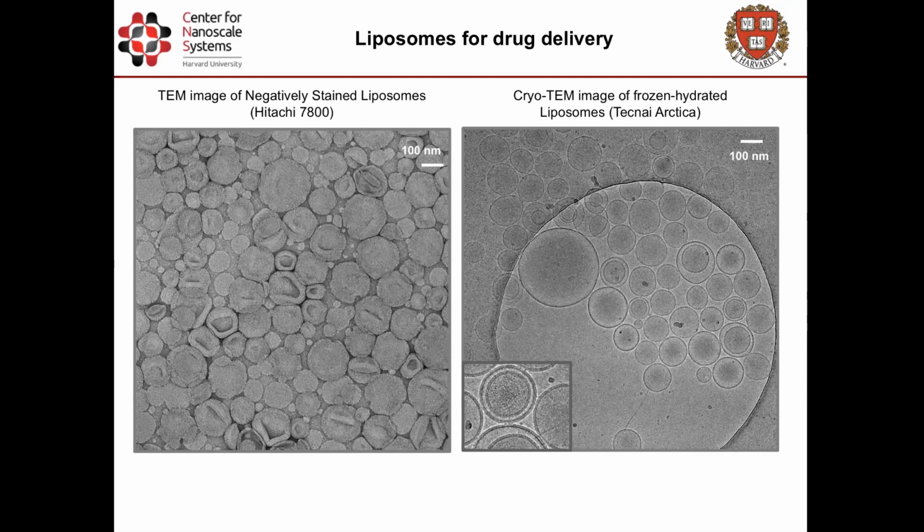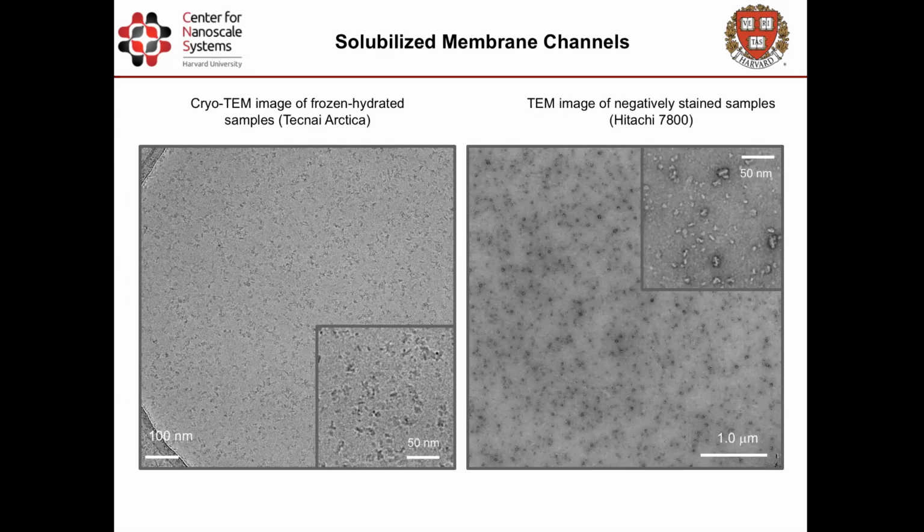Imaging in cryo-EM is much more complex than in negative stain because the information has to be recorded before it's visualized, and it has to be recorded properly. Therefore, you really have to practice on the standard specimen. The other thing is that the sample is not uniform. If you have a complex sample, you will have to look over 300 squares. Each square has like 40 holes, and this will take tremendous time and looking power. You have to look at each image over and over, and you have to translate the information back in your brain.